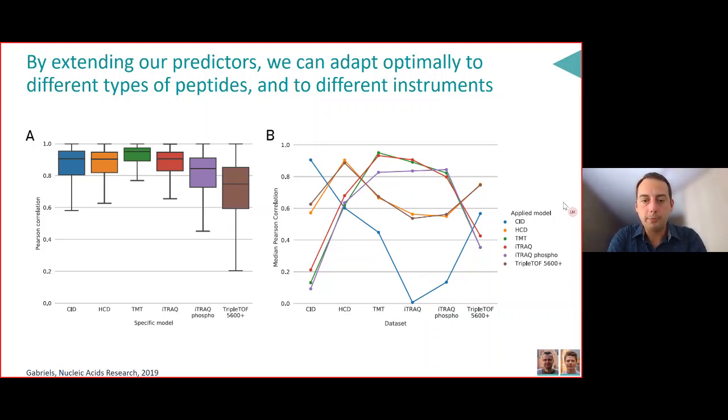MS2 patterns. It would be possible to figure out at least which characteristics are important. However, we have not done that on TMT. We have not specifically looked at which things are more important. I can tell you in generic terms that what matters is for shorter fragments, the ionizability is very important, as you would expect. So the capacity to hold the additional charge safely. Because, of course, smaller ions that have a charge and can't really hang on to it thermodynamically very well, they tend to break or lose the charge. And when they lose the charge or break, they disappear from analysis.